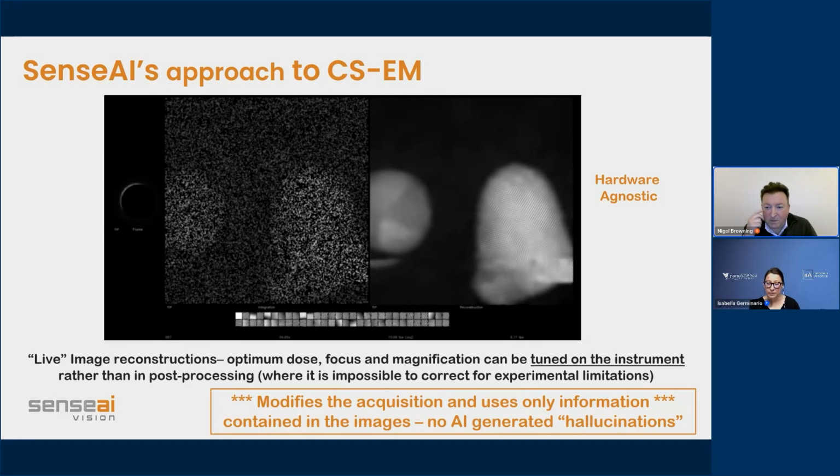Now, if you're trying to do a very fast image, like if in STEM you're trying to do a bright field image or a dark field image, and you're talking about very few microseconds of dwell time, or an SEI image in an SEM, then basically the drift in the beam when you try and move direction, the hysteresis in the scan coils means that you very easily lose the place that you're at. So that pure random pattern begins to go away in terms of its optimal way of doing it.